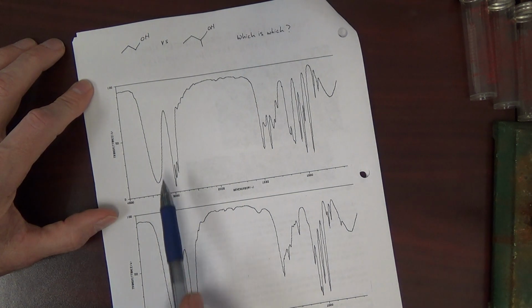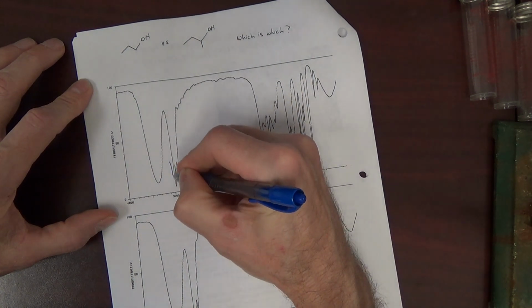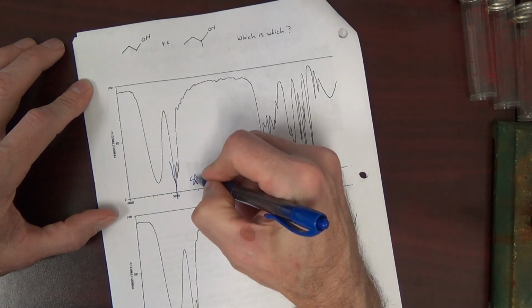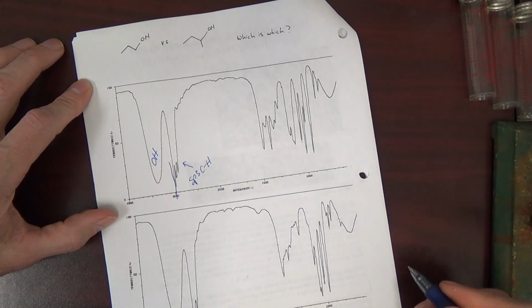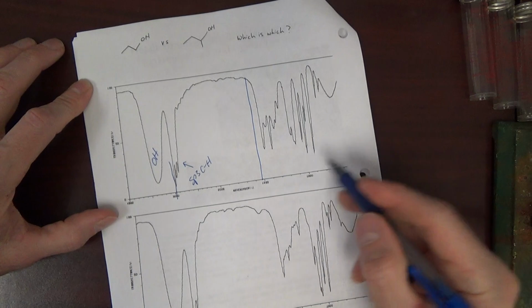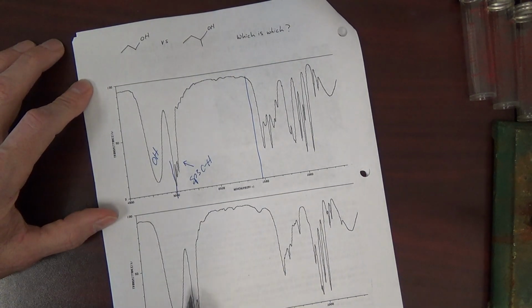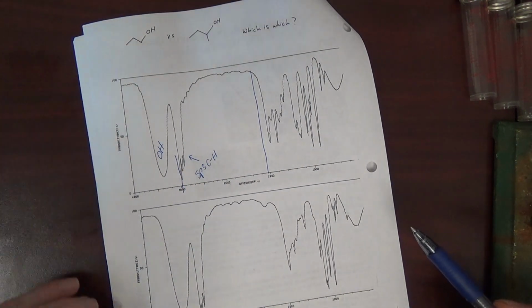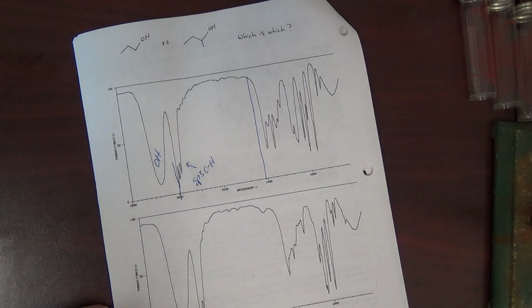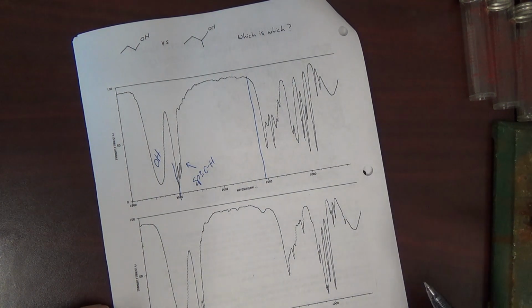Both of the IRs show an OH. Both of the IRs show just below 3000 sp3 C-H, correct? And then of course both IRs show a fingerprint. Very similar. The fingerprints are of course different because it's two different compounds. But which is which? Again, nearly impossible to tell.